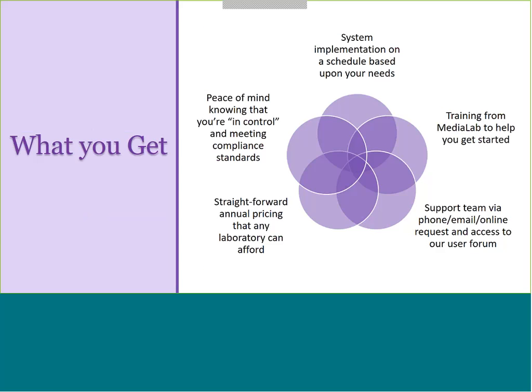So the difference with MediaLab, and what I like to emphasize with all of the clients that I talk to, is that we take a personalized approach to each one of our laboratories. We understand the complexities of each and that everybody is unique in their needs. So we'll do system implementation that is scheduled around your needs.